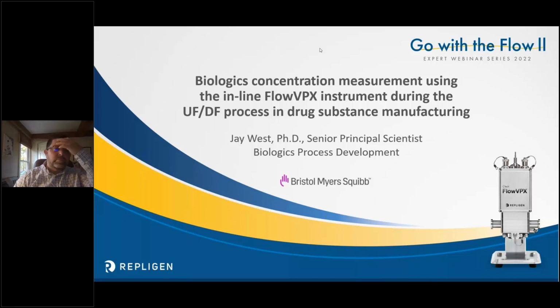He started at BMS in 2014 as an analytical scientist. His focus for the past 5 years has been on process analytical technology, particularly on applications for downstream biologics process development. Today's talk is biologics concentration measurement using the inline FlowVPX instrument during the UFDF process in drug substance manufacturing. Our speaker, Jay West.